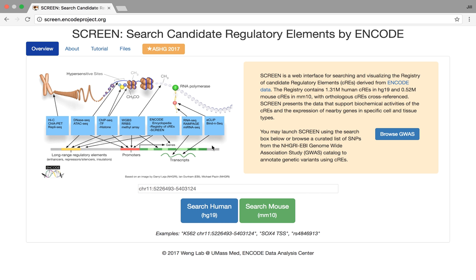If you're playing with SCREEN now, which you can go to at screen.encodeproject.org, if you find something really interesting, feel free to ignore me and you can point out something interesting later. Hopefully the demo gremlins will leave me alone for now.